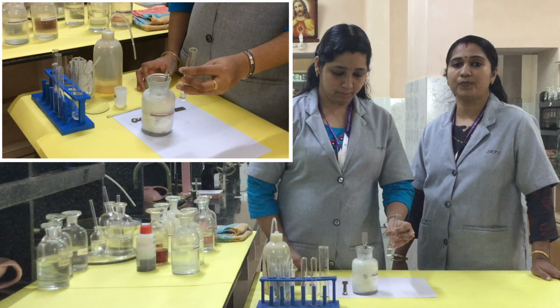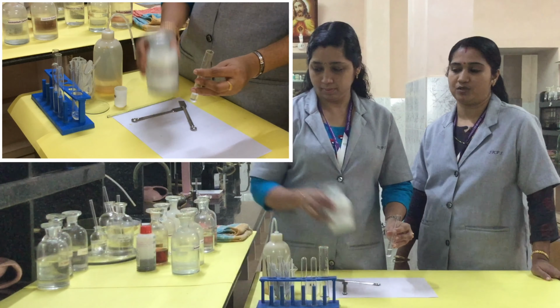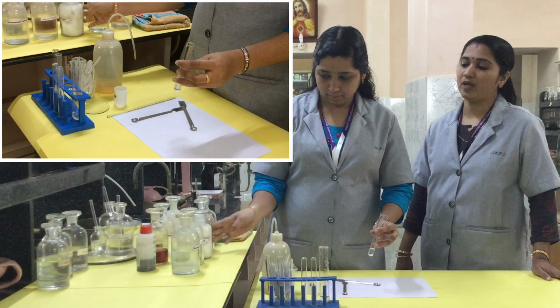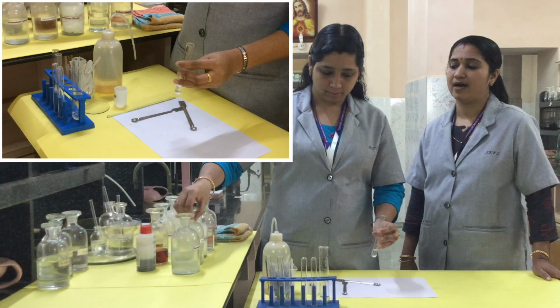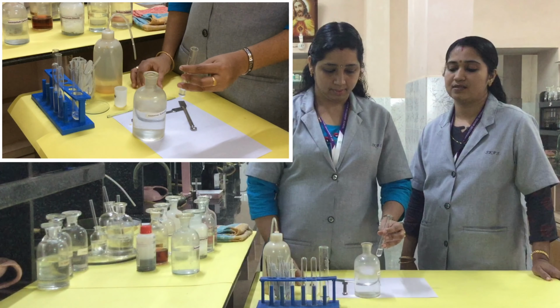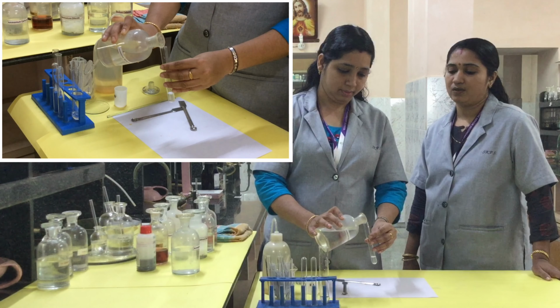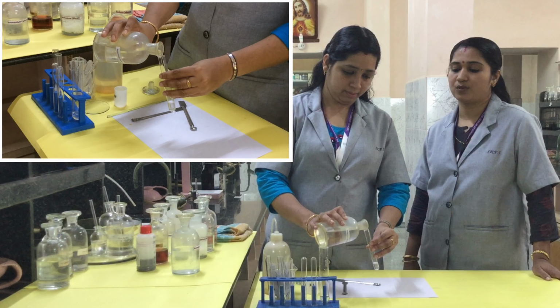Now the next group reagent for group 3 is ammonium hydroxide. An excess of ammonium hydroxide solution is added for analyzing group 3, that is, the presence of aluminium that we want to check. Ammonium hydroxide solution is added.